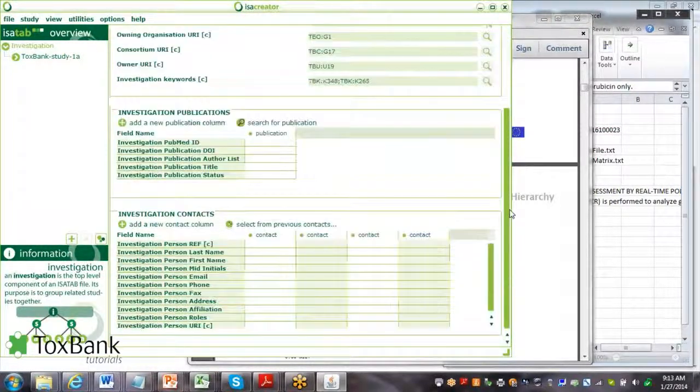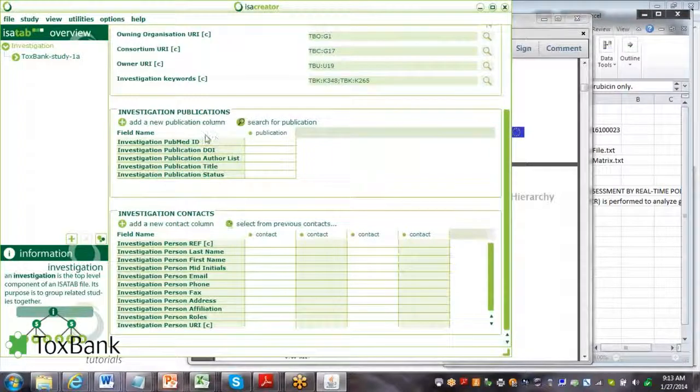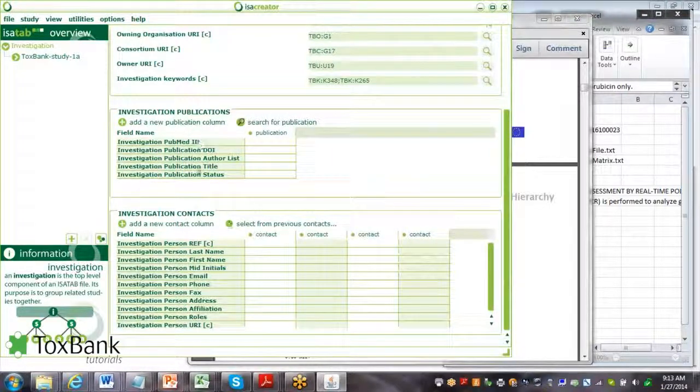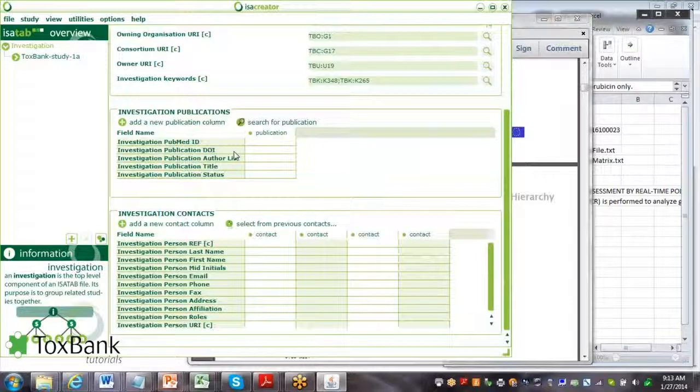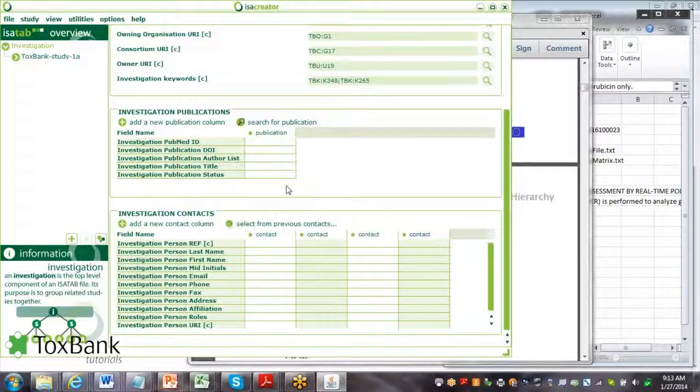If you have a publication - a title, authors, PubMed ID or DOI - you can add it here.